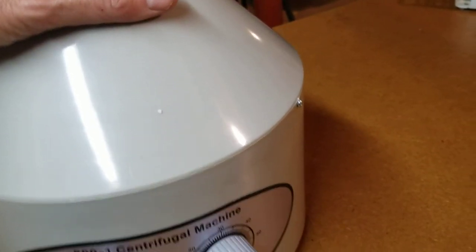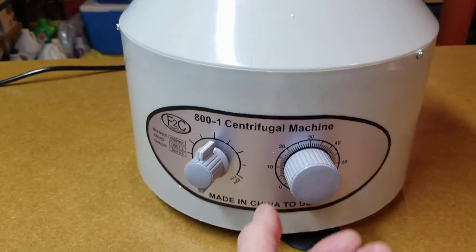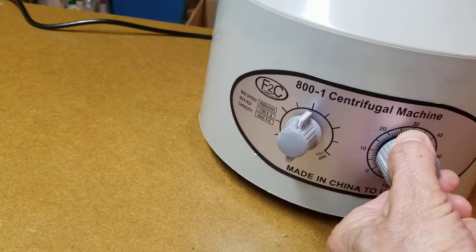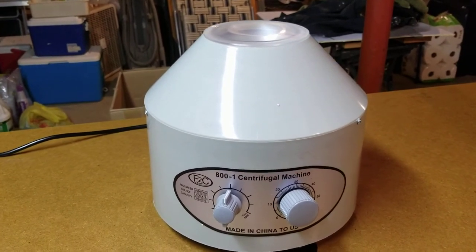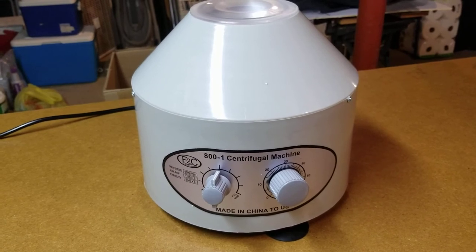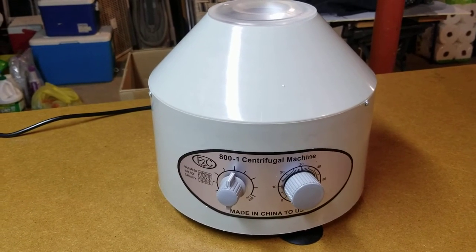I have it set right now for 2000 RPMs. Like any manual timer, you turn it higher than you want and then dial back. This is relatively quiet — I don't think I'd put it in the TV room during a quiet movie scene, but it's not annoying at all. You just set the timer and it shuts off when it's done.